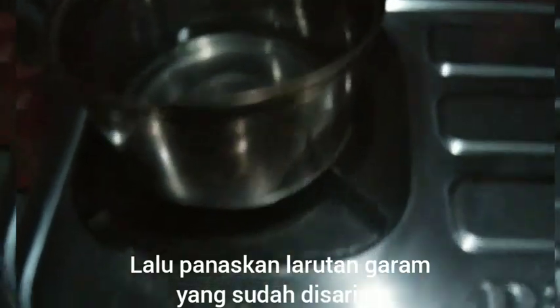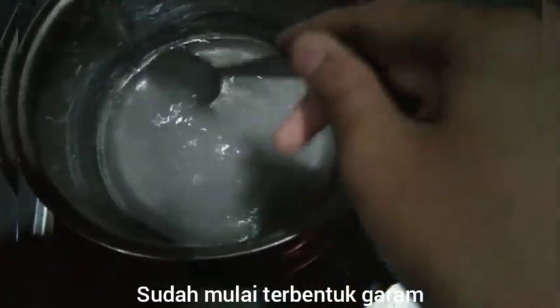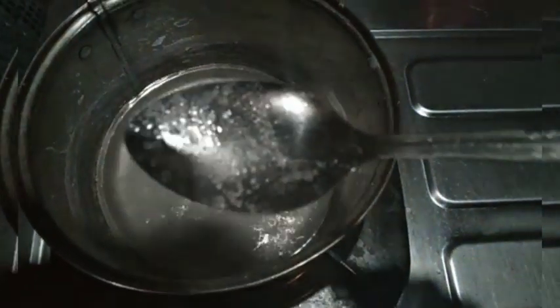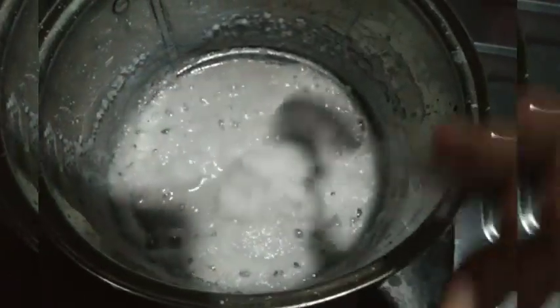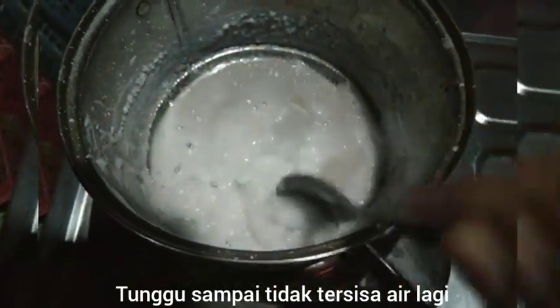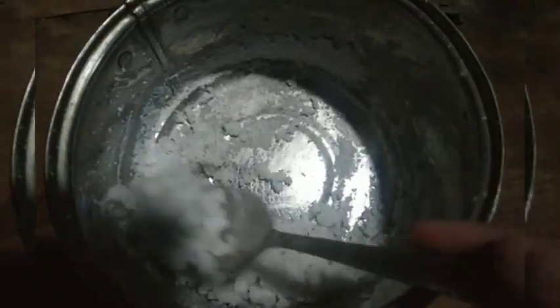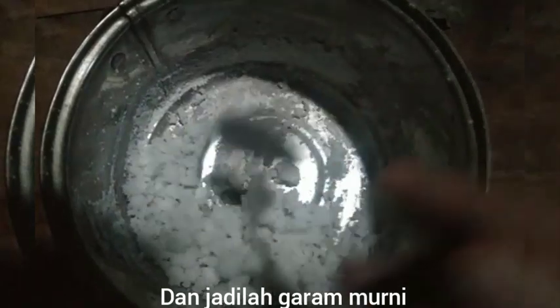The last step: the solution that has been filtered is boiled until the water disappears and the mixture forms into salt. And it becomes pure salt.